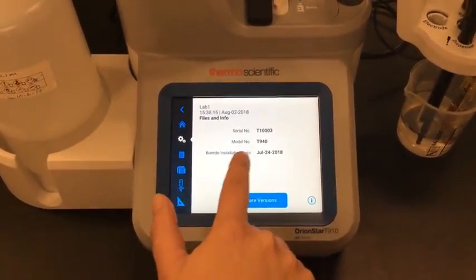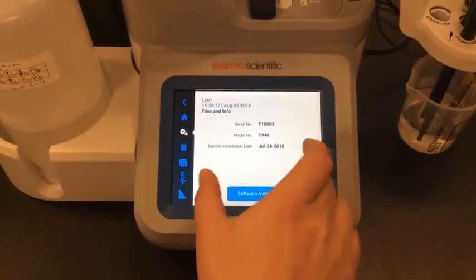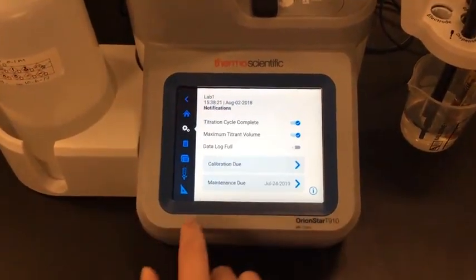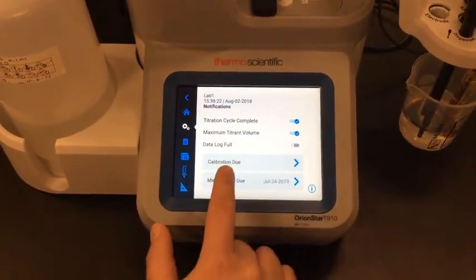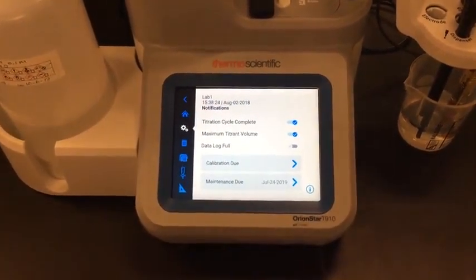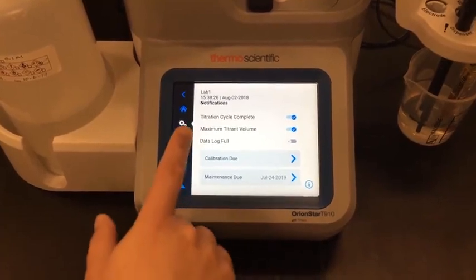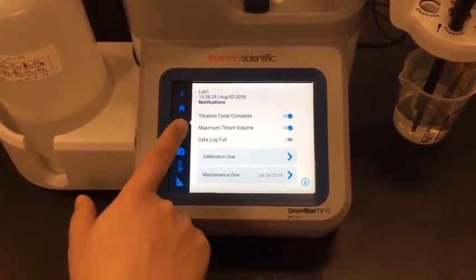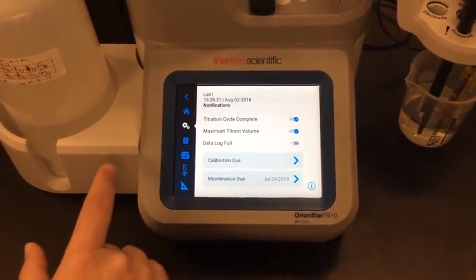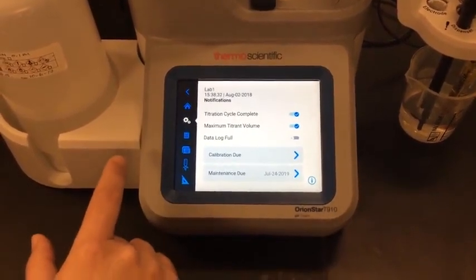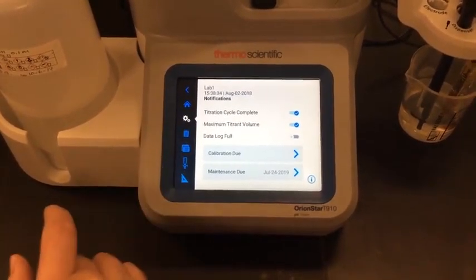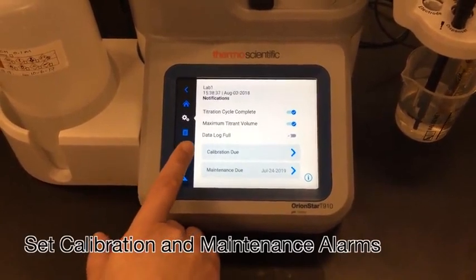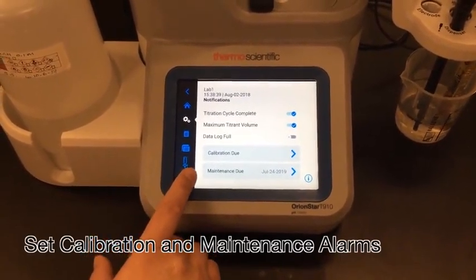If I want to know my titrator serial number and model number, I can look right here on the files and info screen. I also have the notification section, which allows me to set an audible alarm when my titration cycle completes, if I reach my maximum titrant volume without hitting an endpoint, or if my data log is full. I also have the option to set calibration alarms and maintenance alarms.